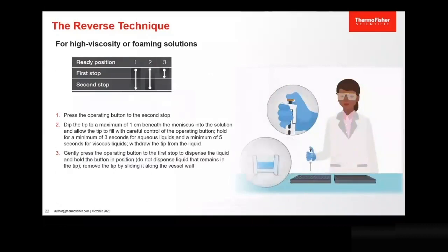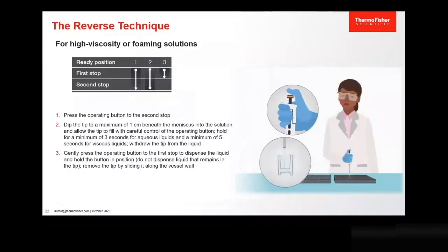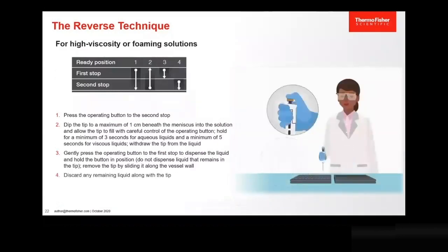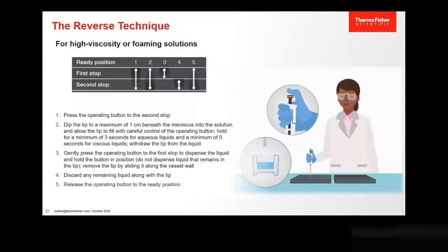Gently press the operating button to the first stop to dispense the liquid and hold the button in position. Do not dispense liquid that remains in the tip. Remove the tip by sliding it along the vessel wall. Discard any remaining liquid along with the tip. Release the operating button to the ready position.